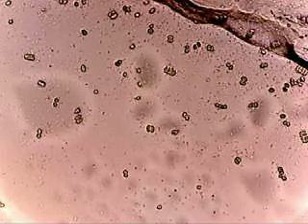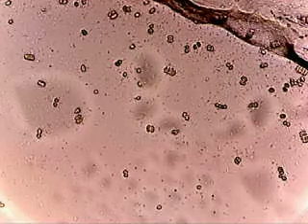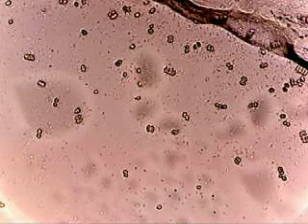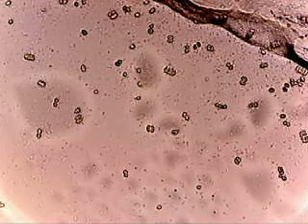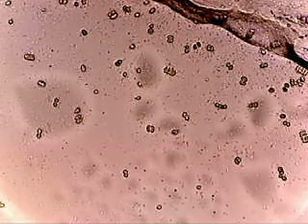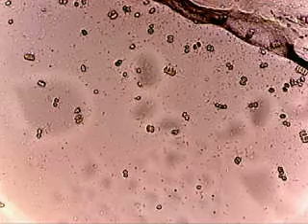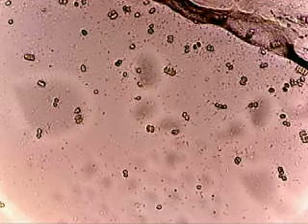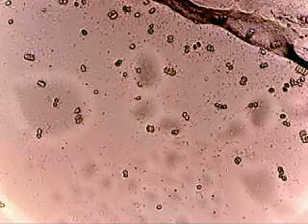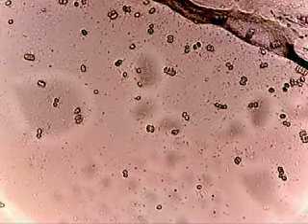First and foremost, the larger strips where you see four bound together, the biggest ones, the very oval, largest ones, I've seen enough of those, and in fact the pairs of two that are the same size, I've seen enough of those. I'm not at all amazed by that. But the smaller pairs of two and the smaller singular ones, I don't remember seeing those before.